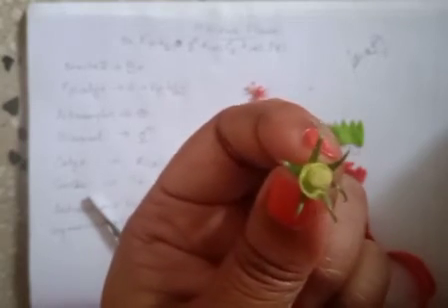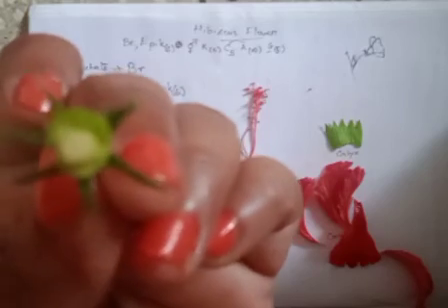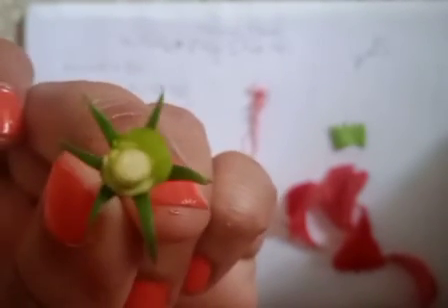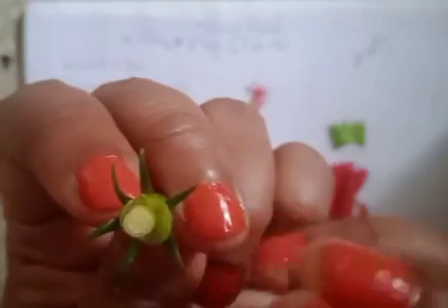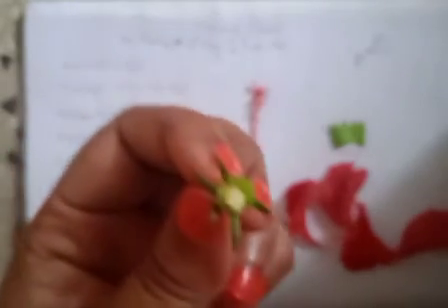Okay, so based on what we saw right now, if I have a closer view of the ovary, if it is made visible to you, hope you can see it. So now based on this we will try to draw the floral diagram. Okay, so these are the ovules that you have. Here what you see, these are the ovules. If I have another cross section, I will be able to show you. So you see here the ovules are there.